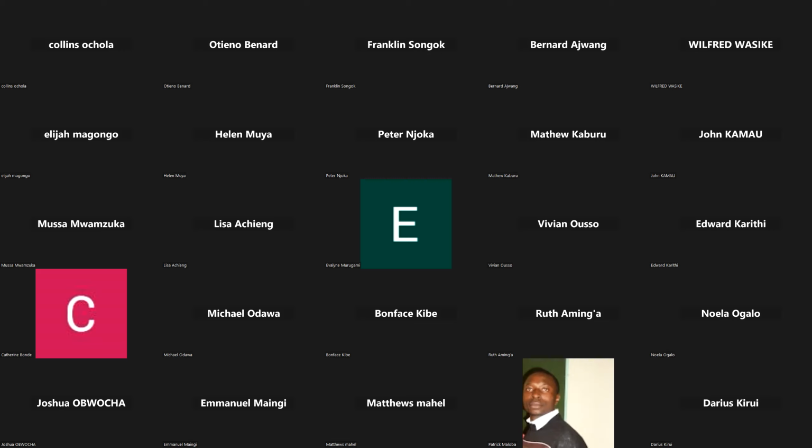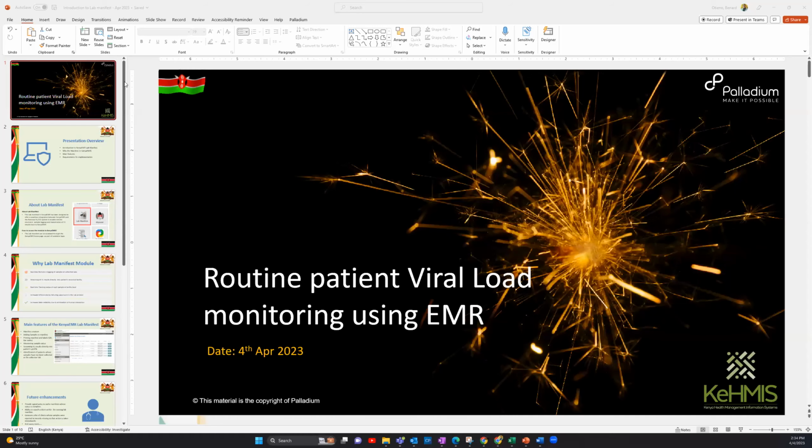Not yet. Probably there's some lag. Yes, it's now visible, so you can proceed. Thank you.